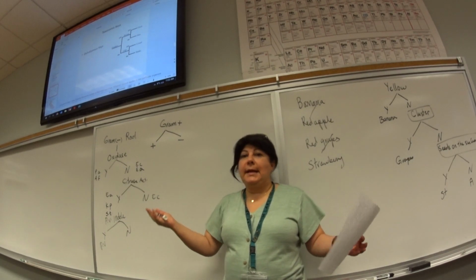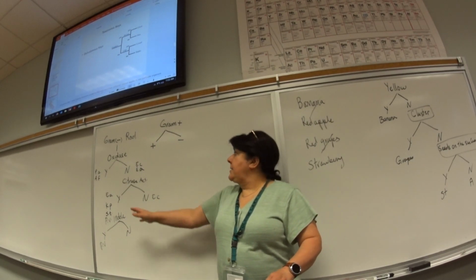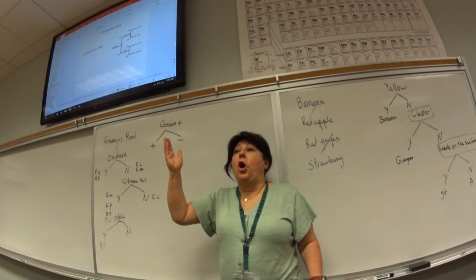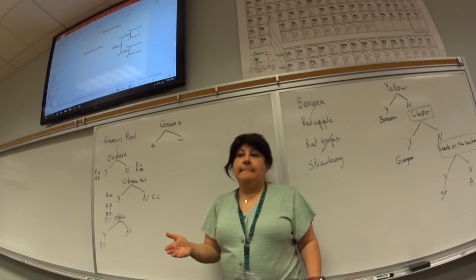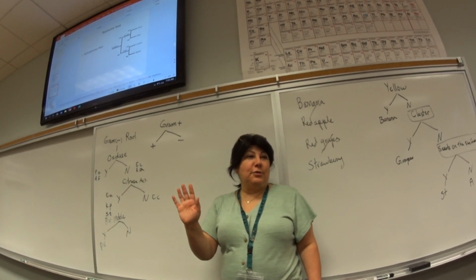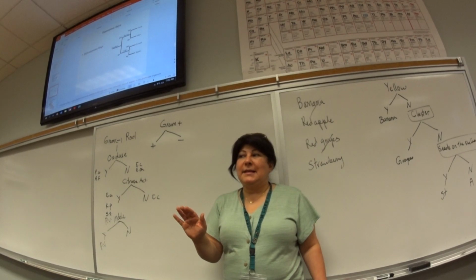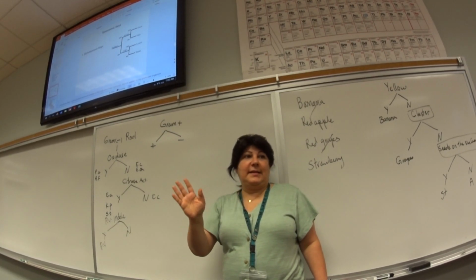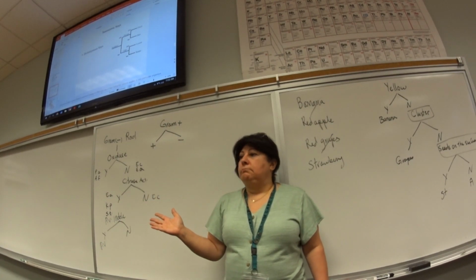That's okay. So again, let's say you did more than these tests. You don't have to put all of them on the dichotomous key. You can choose, all right, out of the 5 tests that I did, in order to make a pretty dichotomous key, I can use 3 of them and it would be very easy and simple. Just use that. All right?